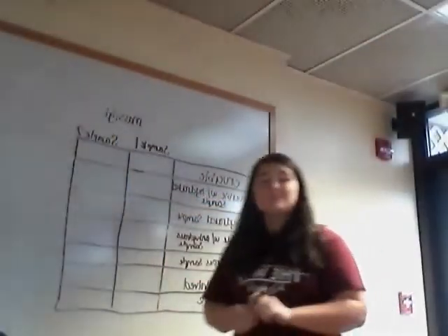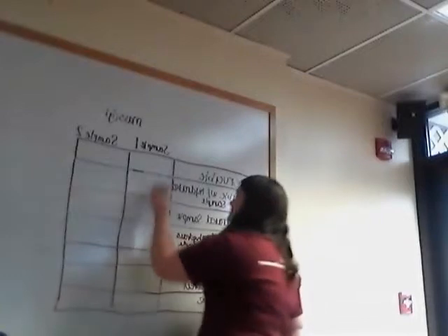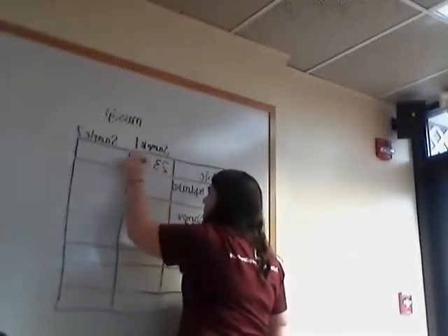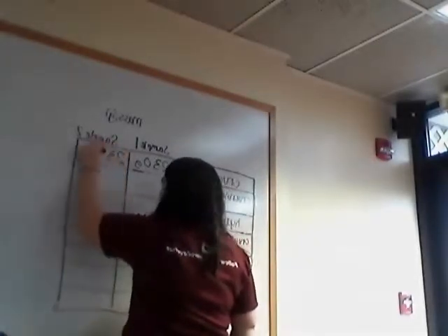Okay, but anyways, after measuring the crucible, we have two samples. One was 23.0 grams. The other was 23.7 grams.